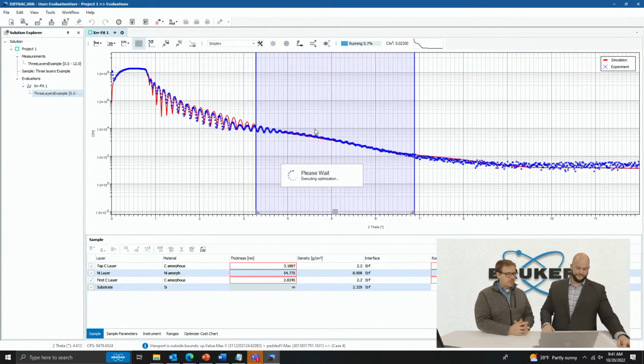Yep. So you would just continue to adjust your model slightly. Sometimes at this point you might even say, hey, you know what? I might have an oxide layer. I might have something that I'm unanticipating in there, and try to adjust it. And I think you have one more example, though. Something that's a little bit more exciting. Yeah, we saved the best for last, the hard stuff.